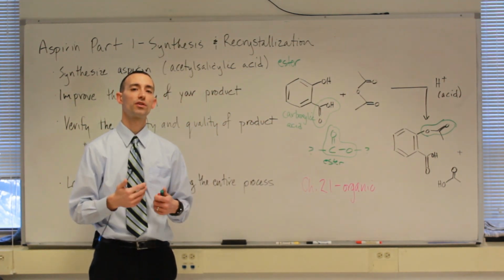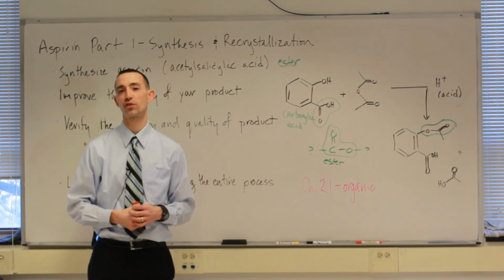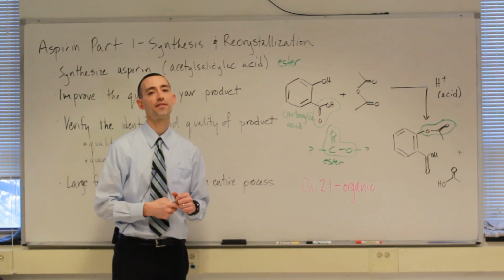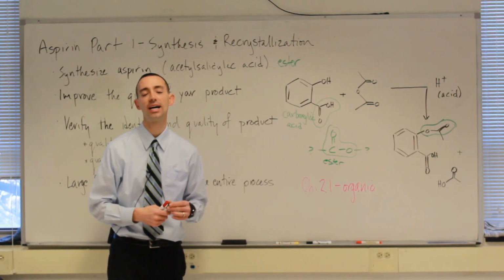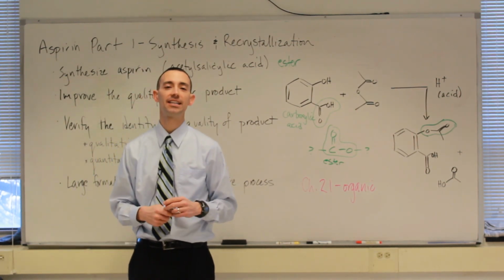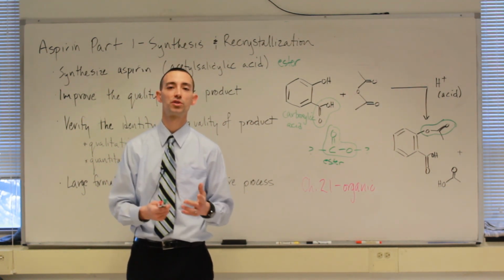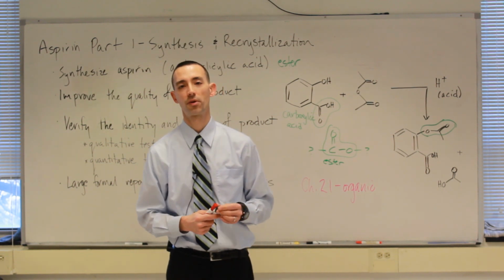And so for those of you who will be doing more chemistry in your future, this is really one of the first chances to learn that good chemistry often takes patience, and it relies on you setting aside that time and observing what's happening with those descriptive notes throughout the process.